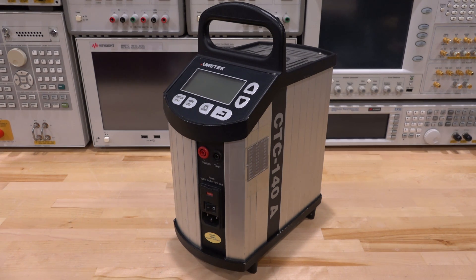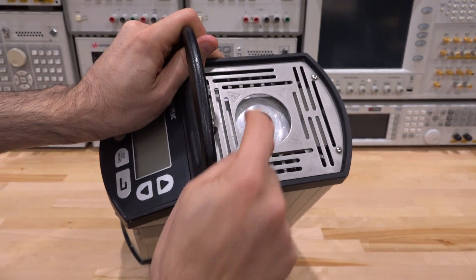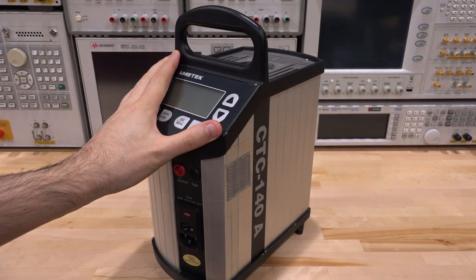Hi, welcome to the Signal Path. In this episode we're going to try another repair. This is an Amtek Joffra series temperature controller. It's actually a pretty interesting device. It has a little cavity at the top and you can drop something in there and control the temperature of that cavity very precisely with a built-in temperature controller.